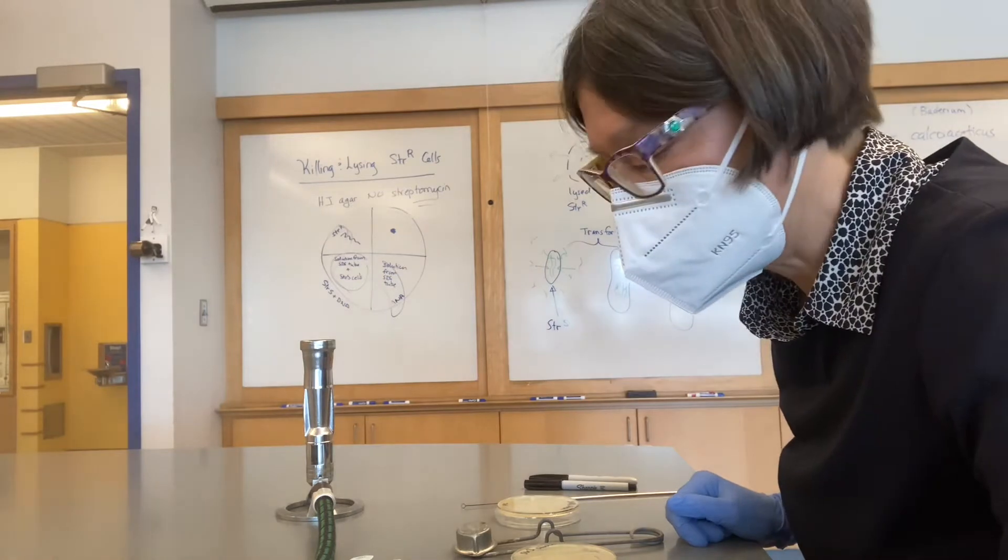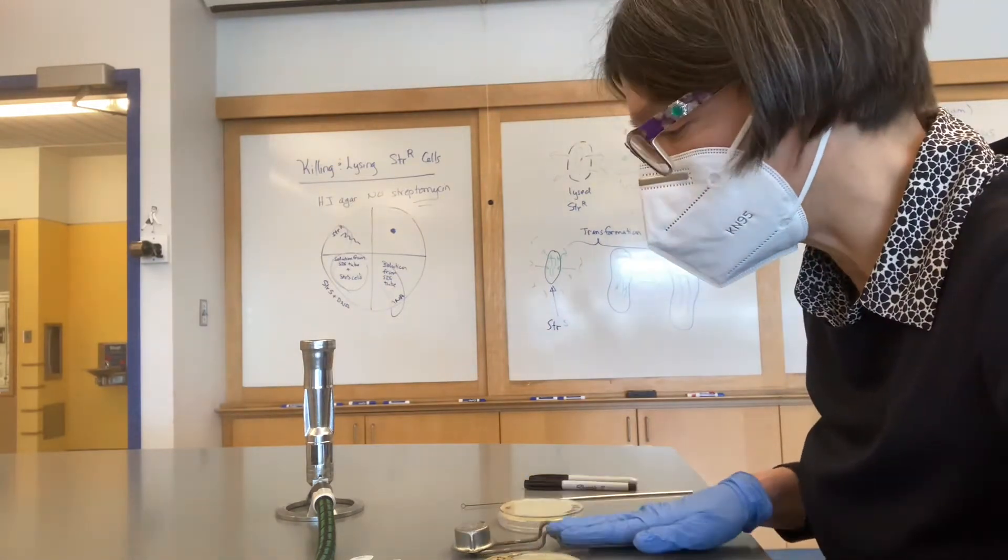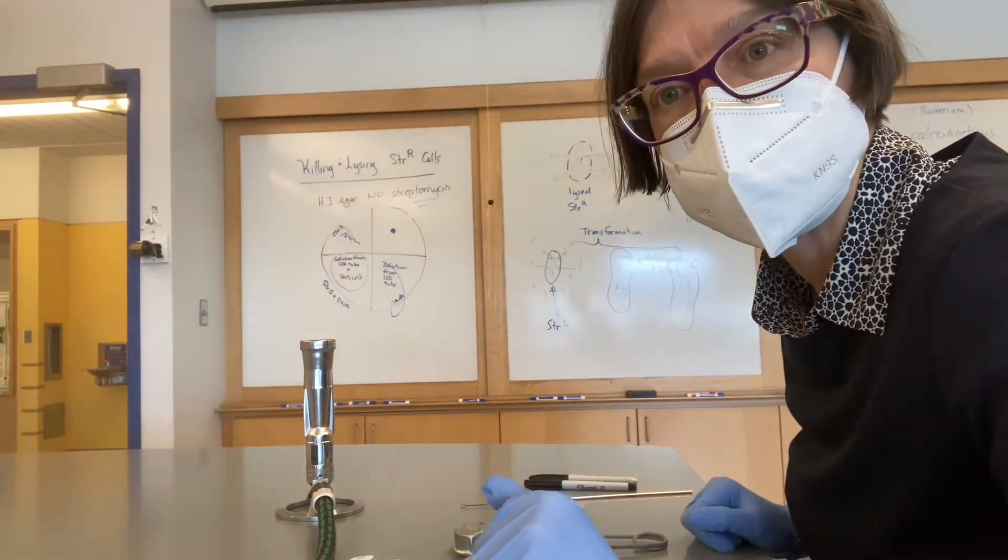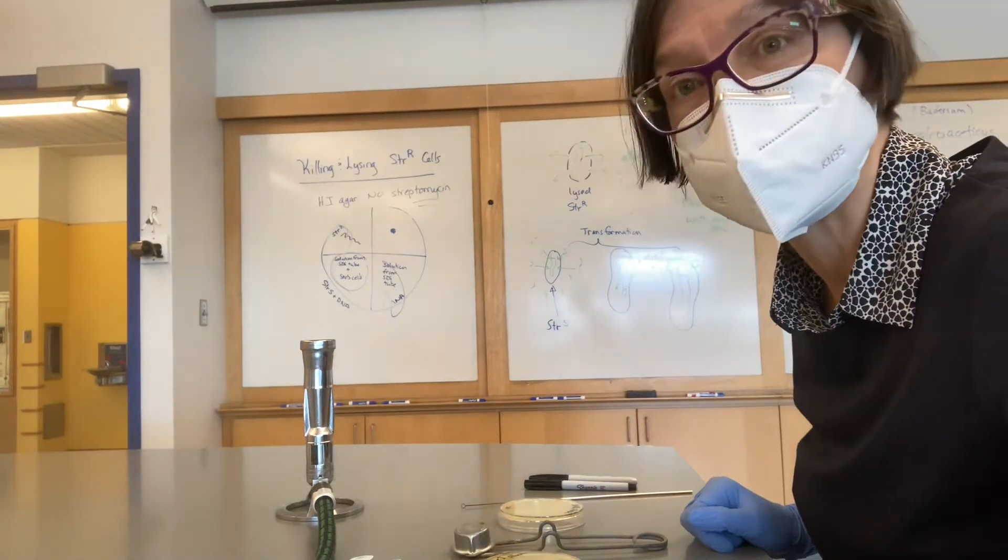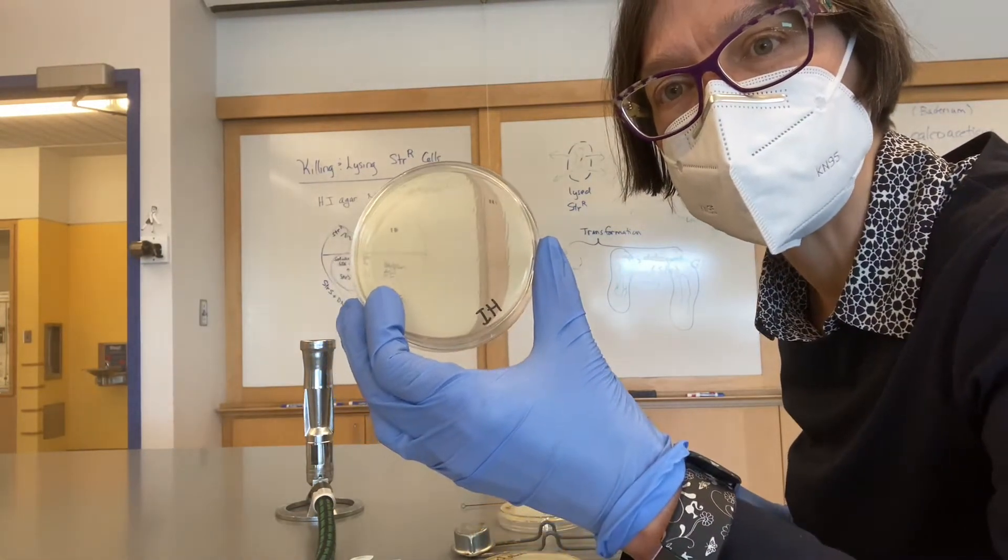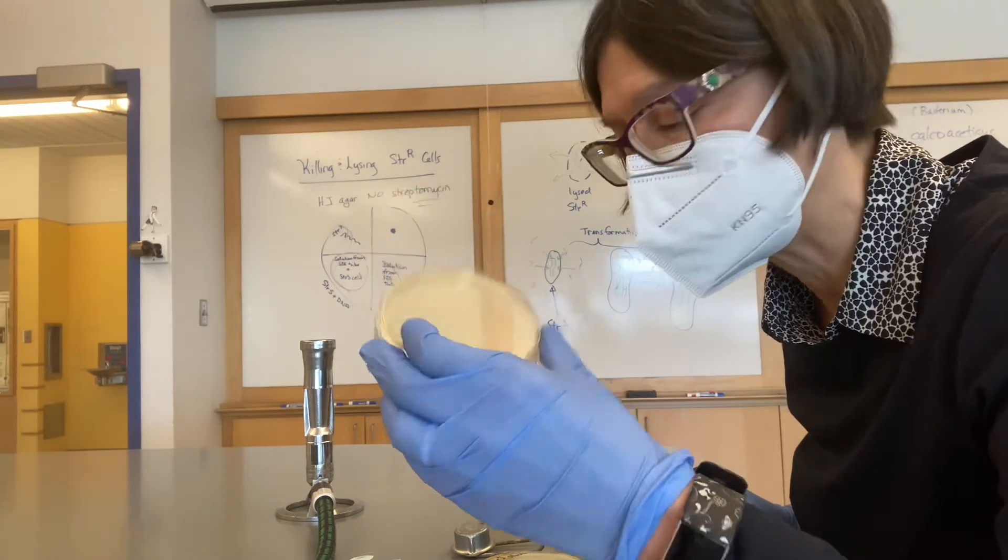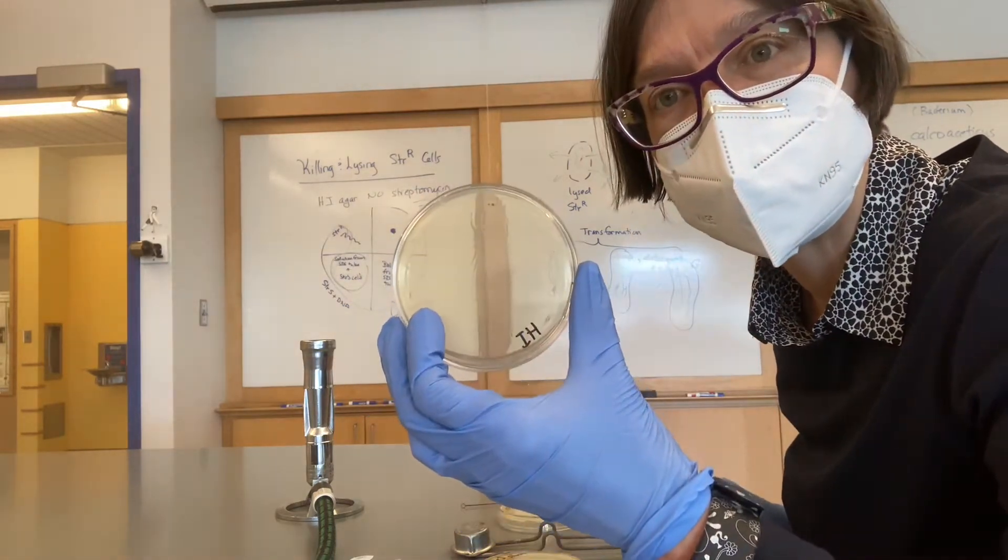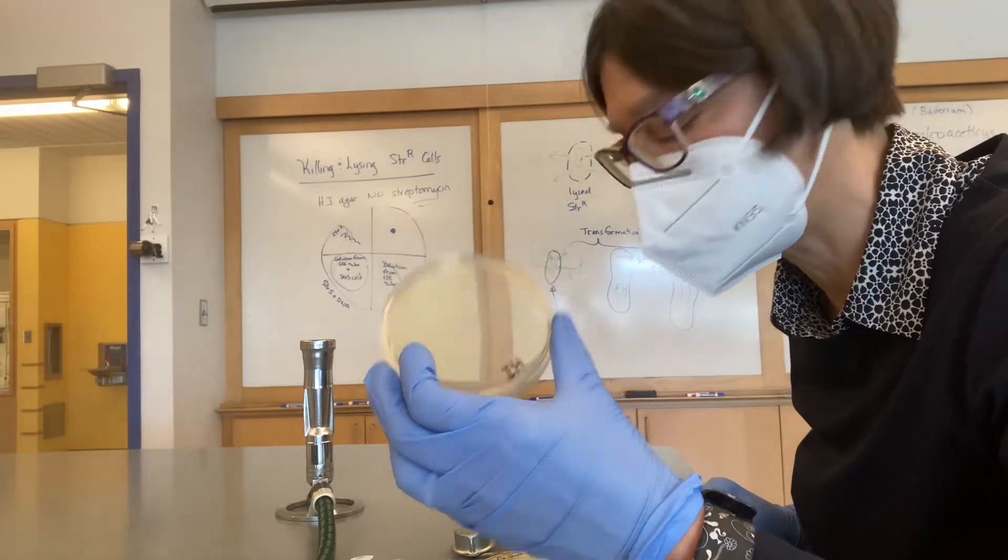To start this experiment, you can take a look and see the different pieces of equipment that we have and the different supplies. So what we have is an agar plate labeled HI for heart infusion. It's a growth medium that Acinetobacter species like to grow on.